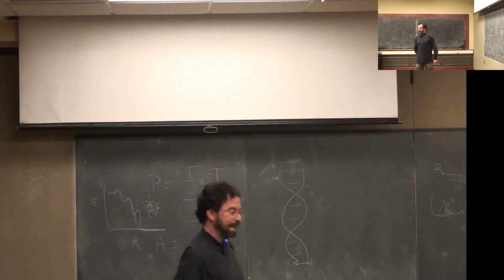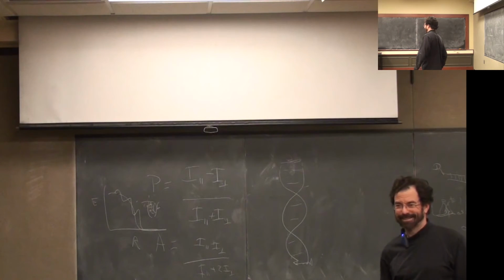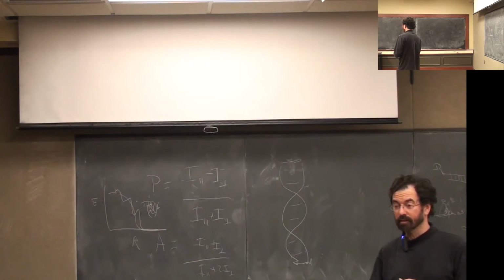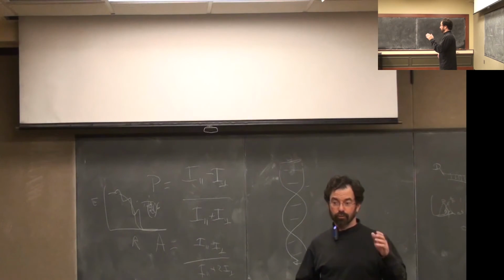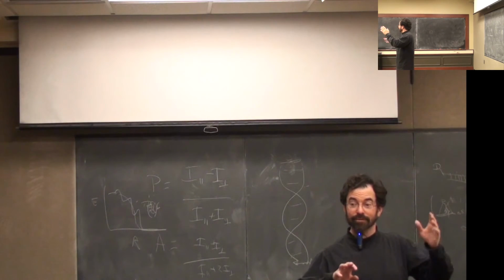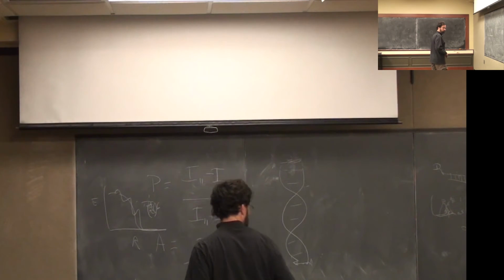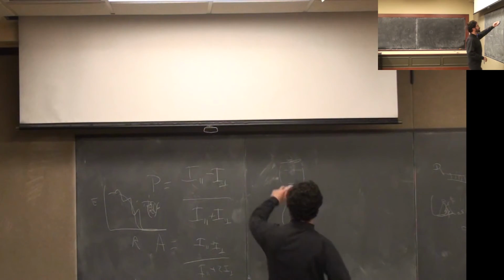Okay, so I think, okay, 3 more minutes. Because I have to tell you about this because it's really, really great. Polarization studies are not only useful for nailing down what kappa squared is, it's also really useful to detect binding events. And for any of you, for example, who are interested in industry or the real life effects of this, you should be interested in this.